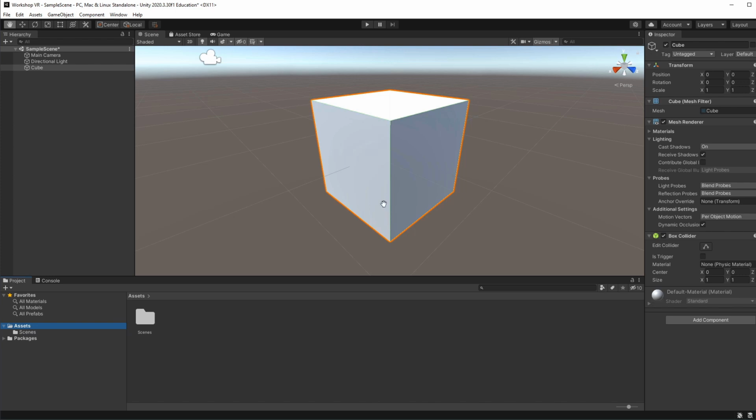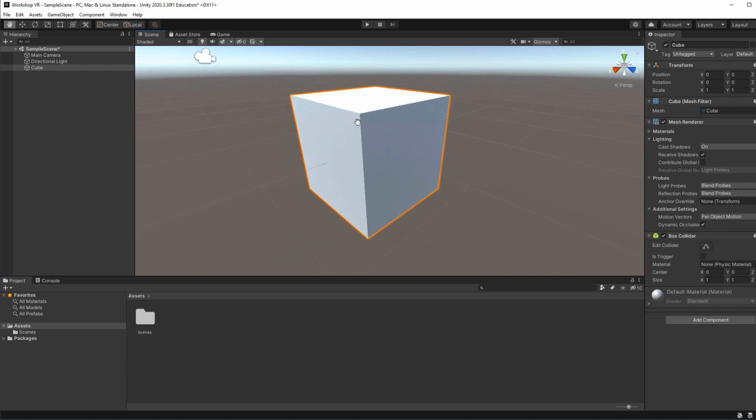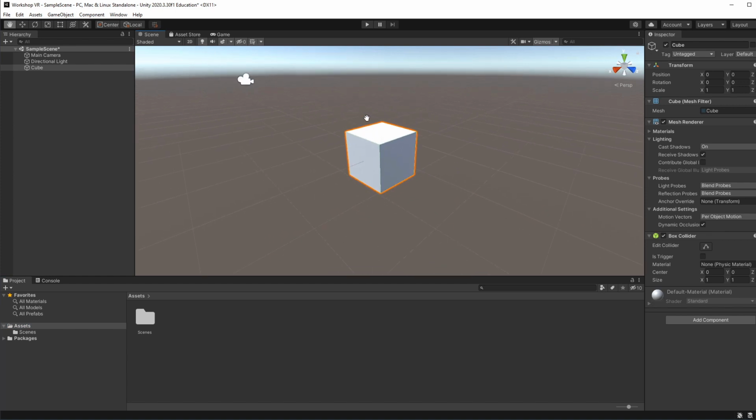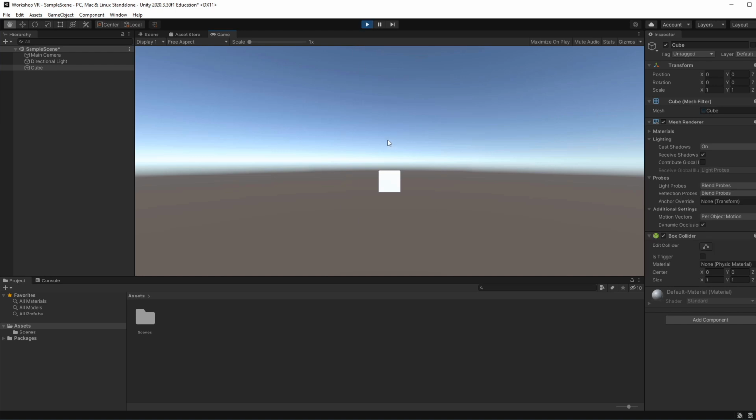All right, and since this is a game, once you're ready to take a look at the preview or to run your game, you can click this play button over here, which should bring you into the game view. You can think of this as the view that your player will see once the game starts. You can use this for debugging, for example, and testing.